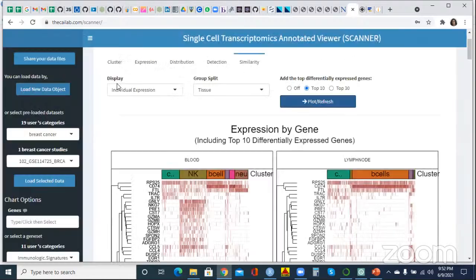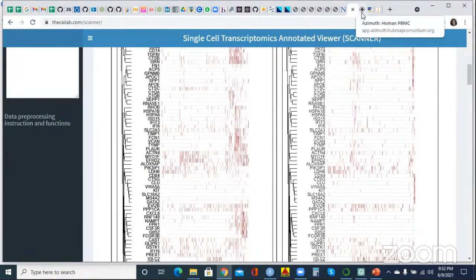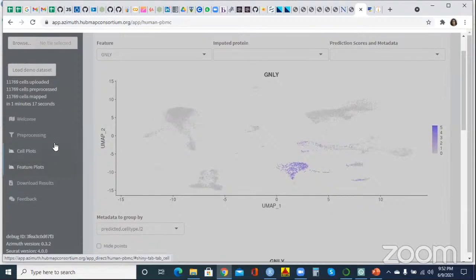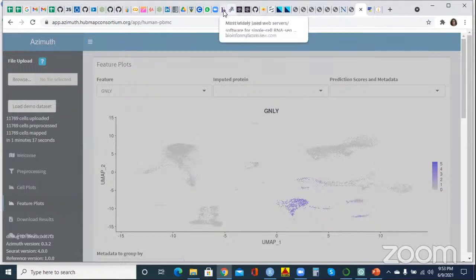Yeah. So when it comes to the future, there's a different section, specifically of those sections or the instruments which we are utilizing with that. We can come up with some information. There is one browser where you can actually use a BAM file directly.